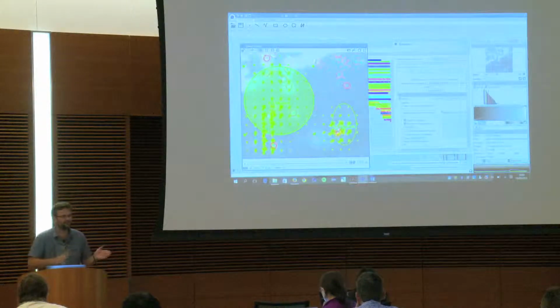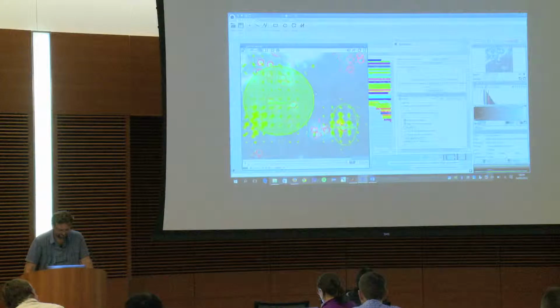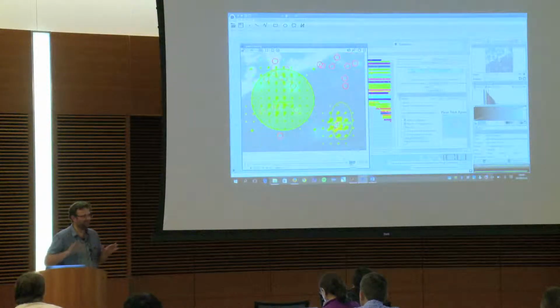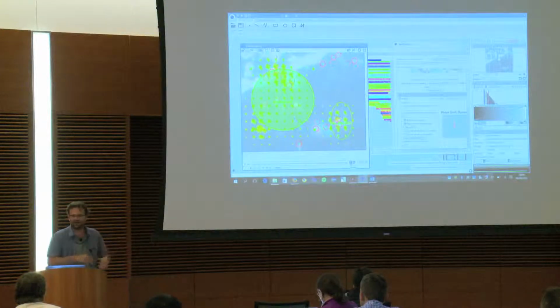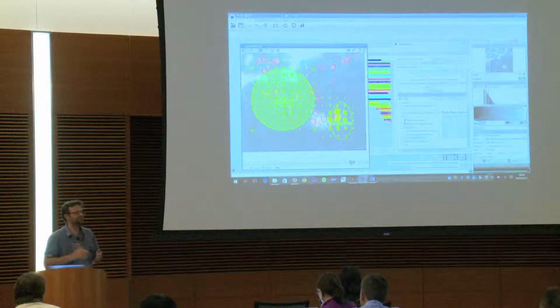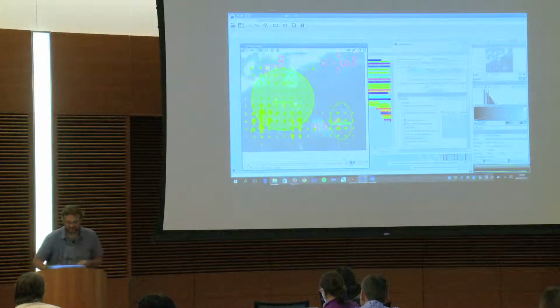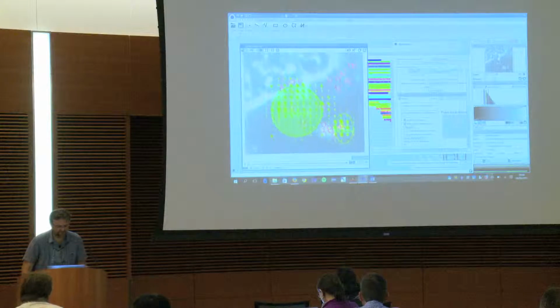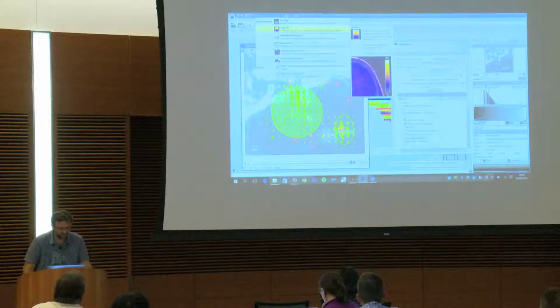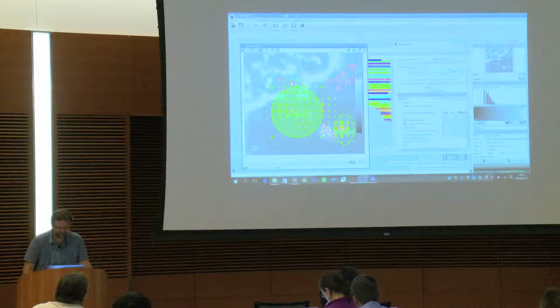But it is something that you can do with... Sometimes I have doubts, because if I go in a way, I will have 10 minutes on it. But I would have liked to show you that with the ROI, it's possible to have tools that are going to help you with the ROIs. And even here, for instance, I want to customize. I want to have the color bar. Okay, so I just click in here, and now I have the color bar.